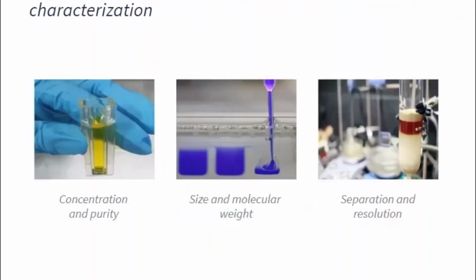as oftentimes looks can be deceiving. If you think about some of the everyday tools that researchers have available to them to characterize proteins, I'm showing 3 common examples that are widely used by all researchers. The first on the left is UV spec or absorbance. It's great for looking at the concentration or purity of your sample. There's SDS-PAGE.